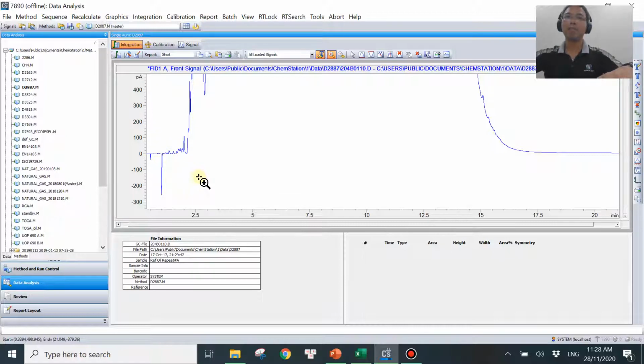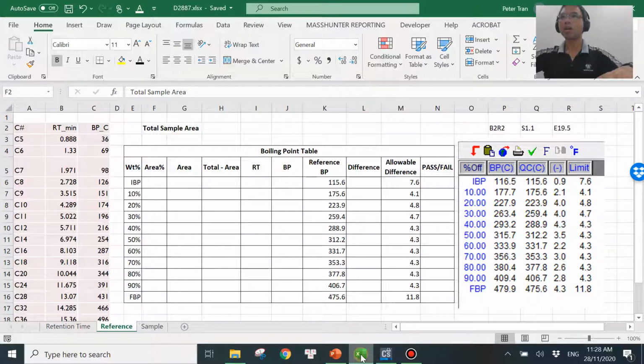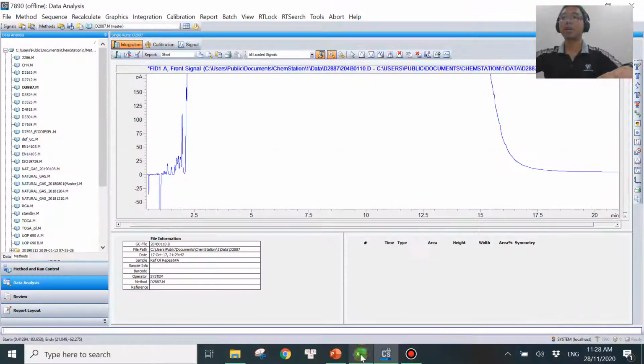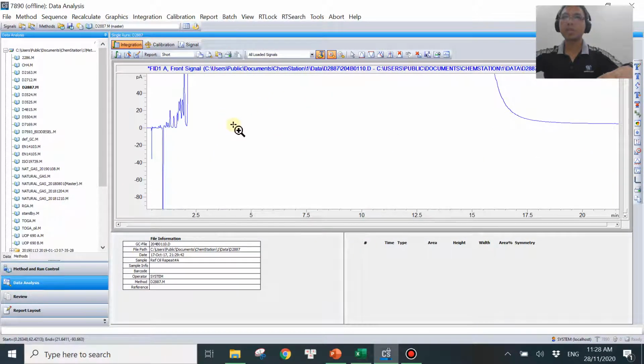But for this video, it doesn't matter much, because the contribution of this negative spike is not really that much for us to worry about. Okay, so let's get into that and let's zoom into this. All right, so let me perform the manual iteration.